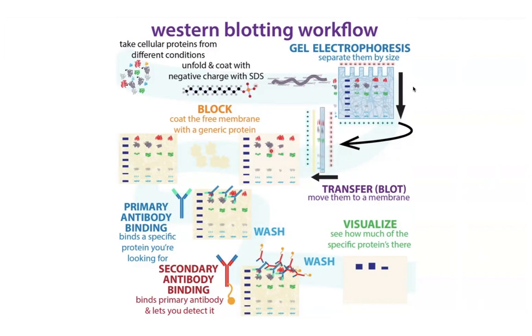Well, do you recognize what might be a potential problem here? We've just been talking about how antibodies are just proteins, right? So we don't want our antibody to stick to the membrane just everywhere, because then we get signal everywhere. If we go and look where the antibody's bound, we're just going to see that the antibody's bound everywhere, and that would not be helpful.